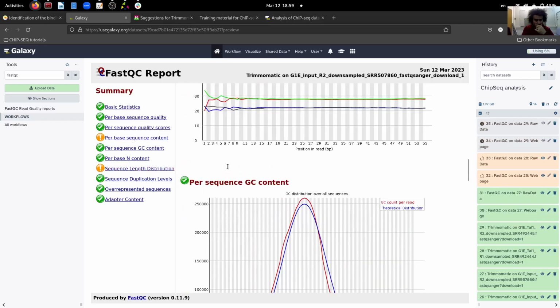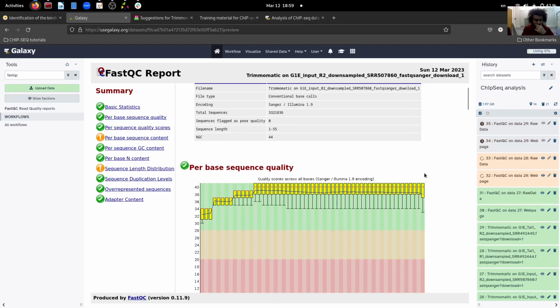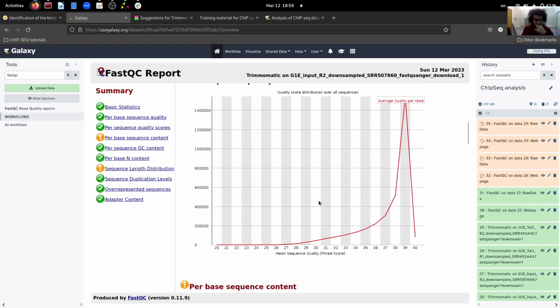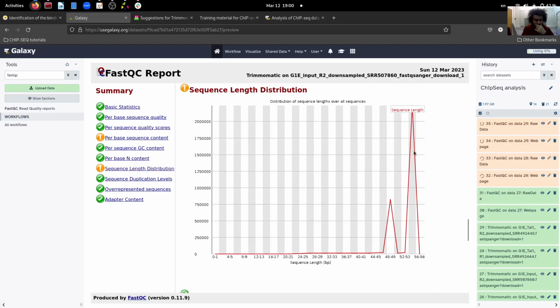Okay, so we have now some results from trimming. So we see here the trimmed data, the trimmed file. I don't remember which one is that, which one we had seen previously, but the quality now is above 32 for all the length of the read, so we are pretty good. The rest are still running, and we see here that some trimming is taking place because not all reads have exactly the same length.